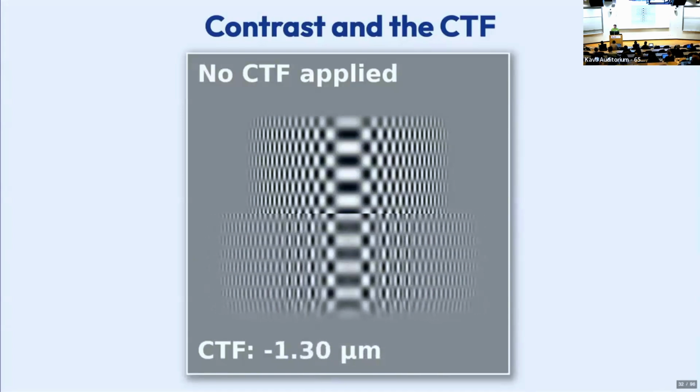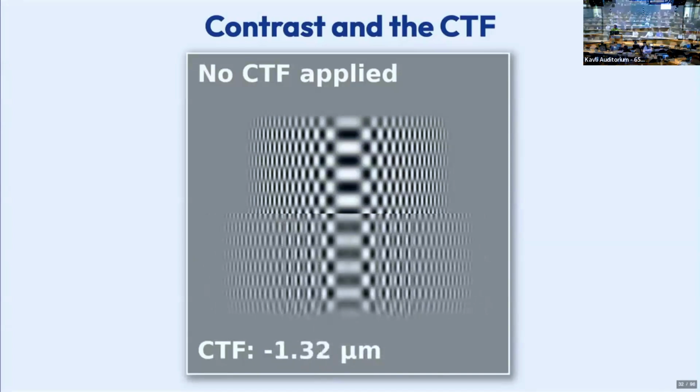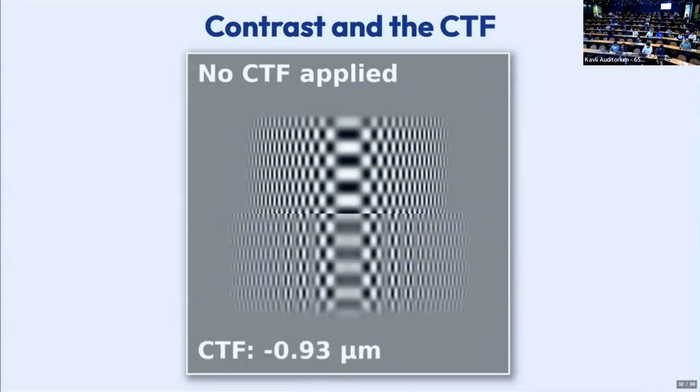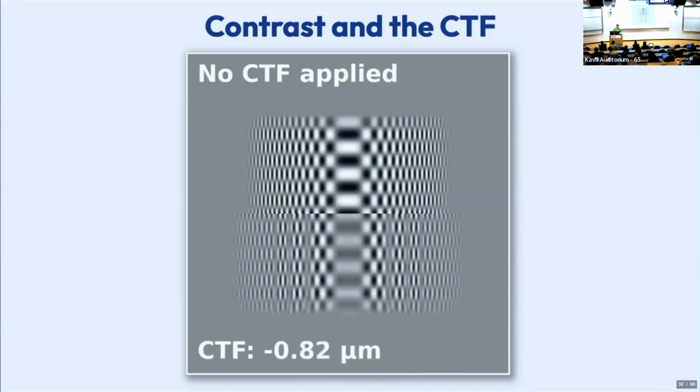One more question. So also, if you're collecting the data set for the first time, let us say, how do you decide what is the best electron dose for your data collection? Yeah, that's another good question. What's the best electron dose? And again, probably something that's a little bit sample dependent and a little bit dependent on what exactly you're doing.